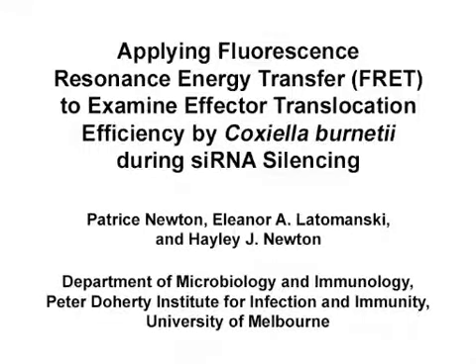The overall goal of this experimental procedure is to examine the impact of specific host processes on the ability of bacterial pathogens to translocate effector proteins. This method can help answer key questions in the field of cellular microbiology, specifically how the host is involved in either blocking or promoting the delivery of bacterial virulence factors into the host cell.